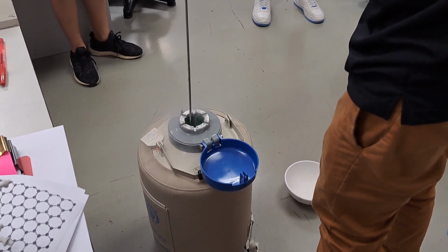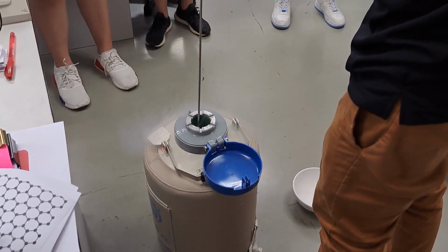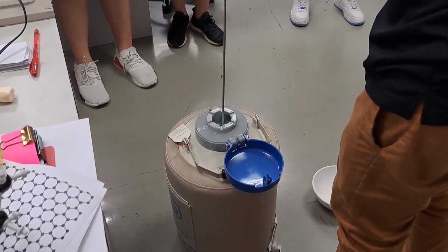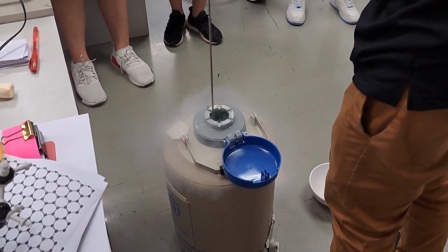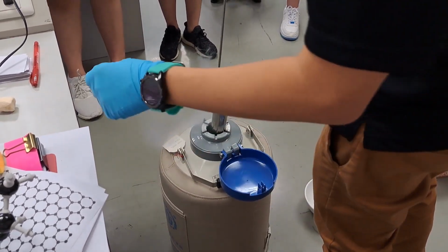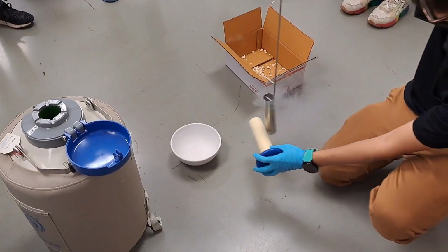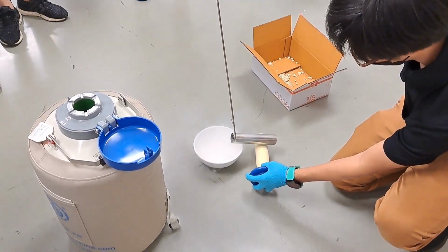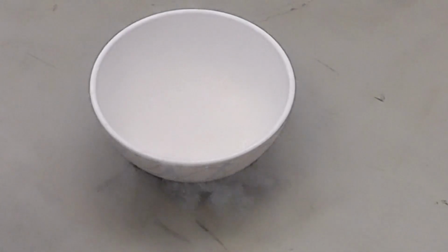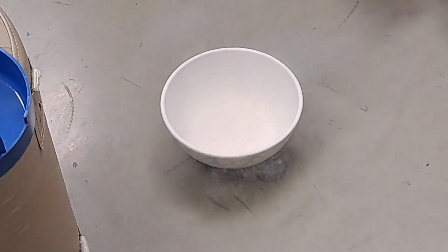And the liquid nitrogen is very cold. Let's say minus 190 degrees. What do you think is the temperature of this one? Room temperature, right? So when the liquid nitrogen touches it, it's gonna boil up. Please make sure you see that it is actually liquid. Can you see? And then gas. What you see is it boiling up. Can I feel the gas? Yeah, sure.